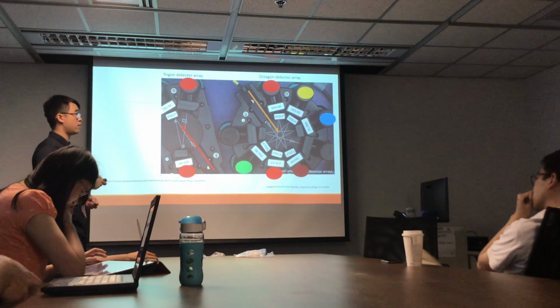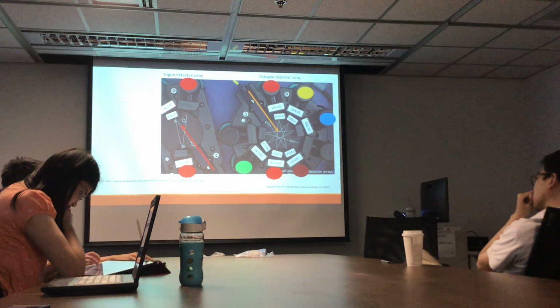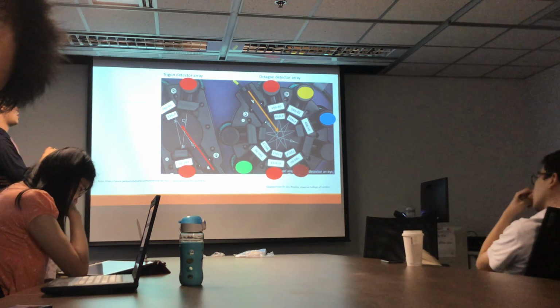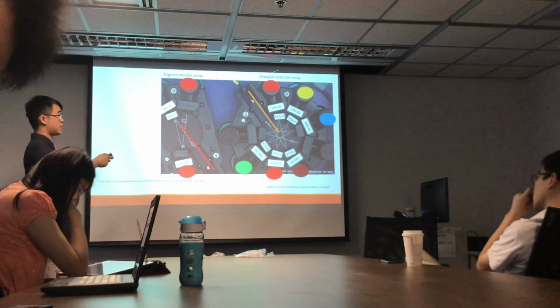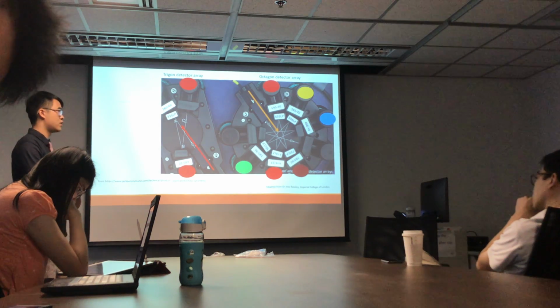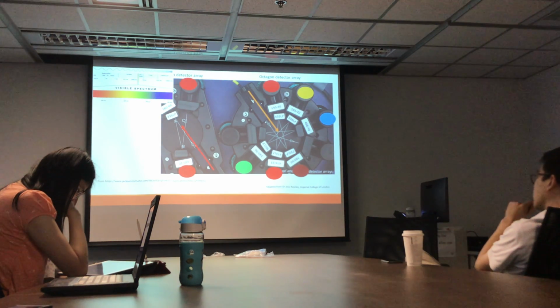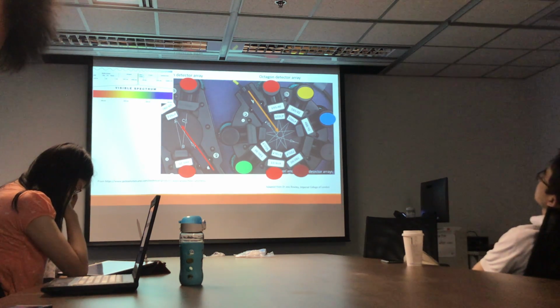And here we have the setup inside of a flow cytometer. Basically this demonstrates two different types of fluorescent detector. One is called the trigon detector array, whereas the second one is called the octagon detector array. We're mainly focused on the octagon detector array for the purpose of our presentation, as I believe it's more capable of demonstrating how it separates the fluorophores. Here is simply the electromagnetic spectrum of the visible region, just to remind you of the wavelengths.